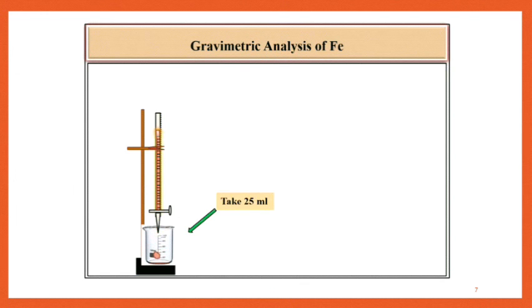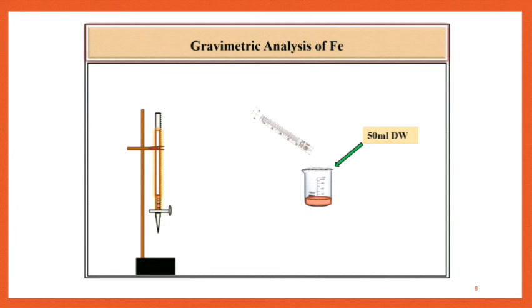Take 25 ml of this diluted solution from this burette and to this solution add 50 ml distilled water by using cylinder.